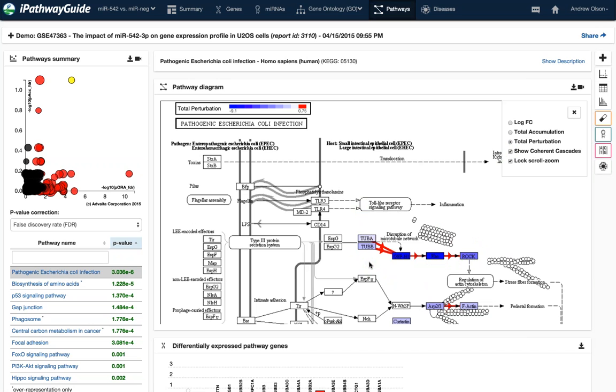So you would want to focus in on these areas for hypotheses and for maybe going on to your next experiment. We take a lot of the distillation of these data out to make it easier for you, so all you have to do is click a button, and you can look at what's really important to you.